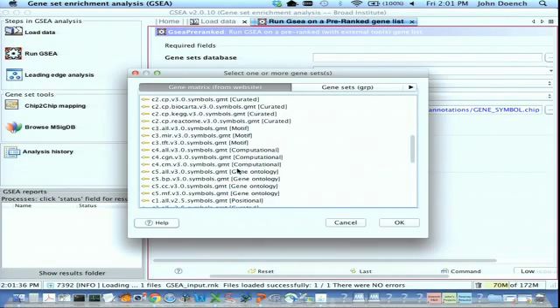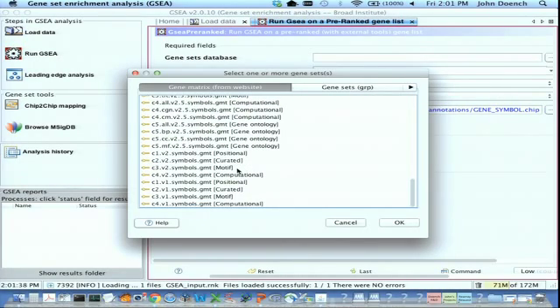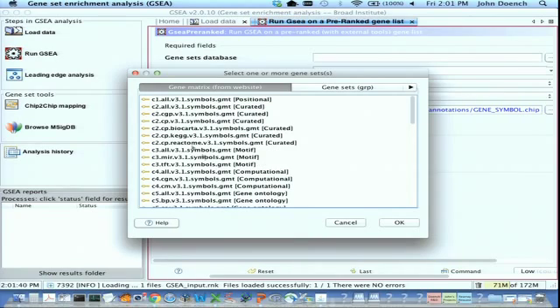So the version 3, the version 2.5, the version 2, the version 1. You don't want to use those. They're increasingly inclusive, so there's no reason to use anything but the latest. So you want to use version 3.1. You'll notice that they also have, at the end, various types of sets. So here's the positional one, but then curated, there's 1, 2, 3, 4, 5, 6 curated.